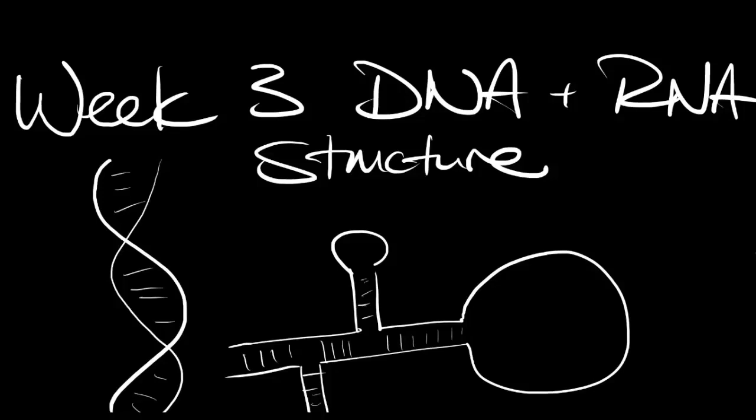Welcome back to the online TA review. In this video, we'll be reviewing a few methods that are related to this week's material. The topics will be gels, Sanger sequencing, southern and northern blots, which will lead us into talking about exercise A.